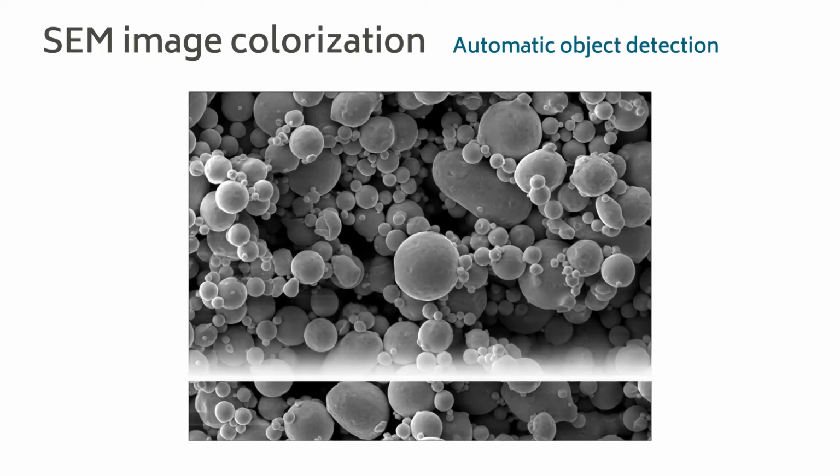A couple of other nice features is colorizing the images. So it makes it a nice presentation tool, making nice posters and things like that.